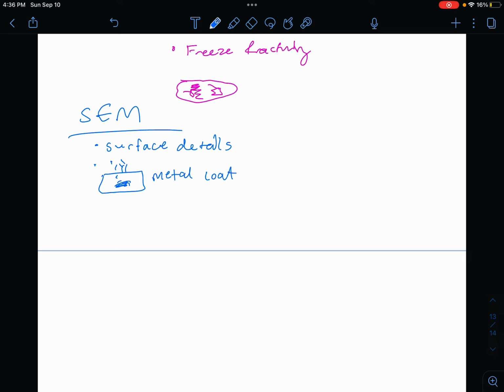Next, we're going to use a beam of electrons. So here's my beam of electrons, and they're going to scan across the surface. I'm just going to go like that. So those are our electrons scanning. And then the electrons that are released from the specimen are going to be observed for a 3D effect. So you might see a 3D effect of this extremely small molecule or bacterium like that. So there we go, our 3D effect is created.